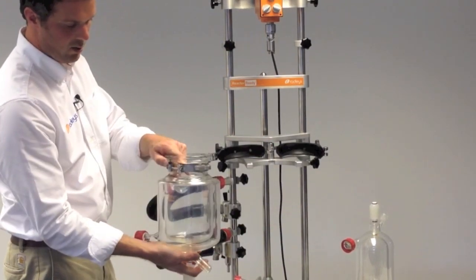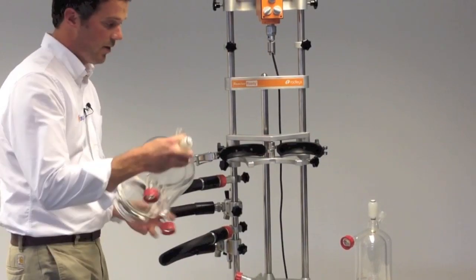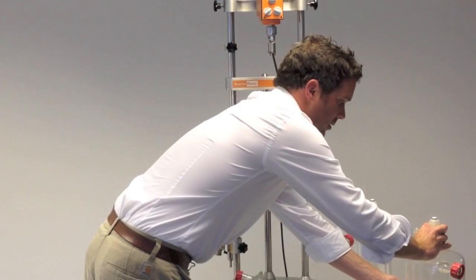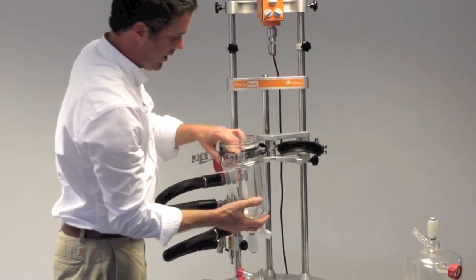The vessels are just hung with a stainless steel support collar that sits in the lugs on the reactor ready framework. I'll just drop in the one liter vessel.